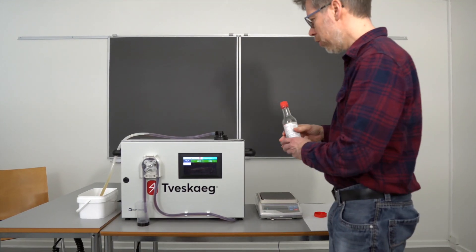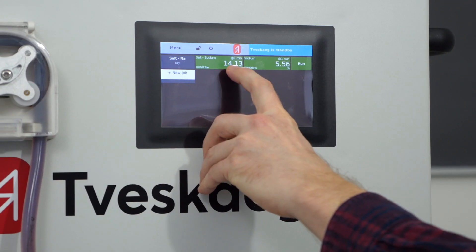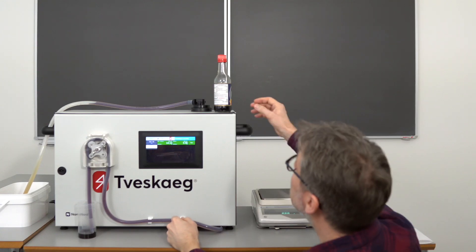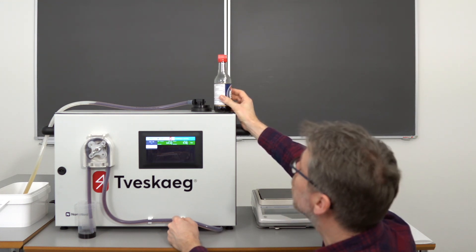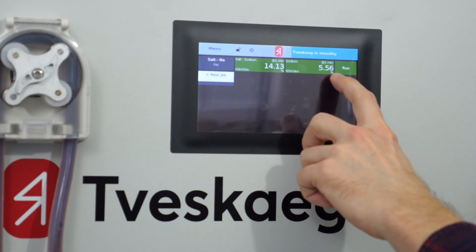The analysis of the sodium content and salt content of the soybean sauce is now ready. After the one-minute run, the system states there is 14.1% of salt in this sauce. If we look at the label, it's declared at 13.4%, which is pretty close. For anyone interested in the sodium content alone, it amounts to 5.56%.